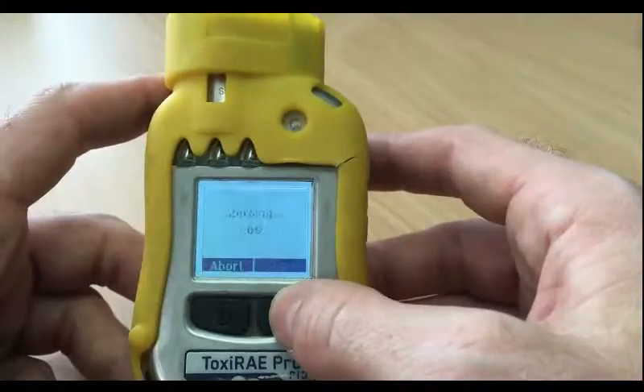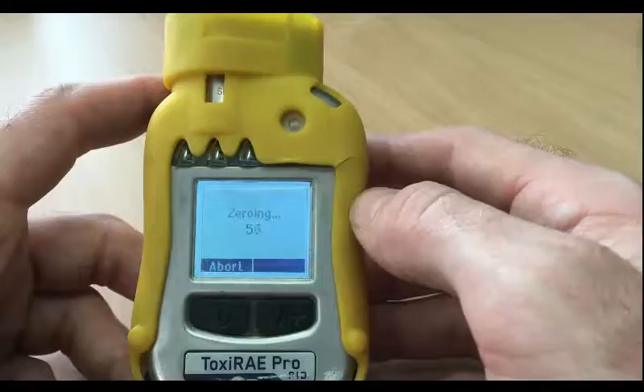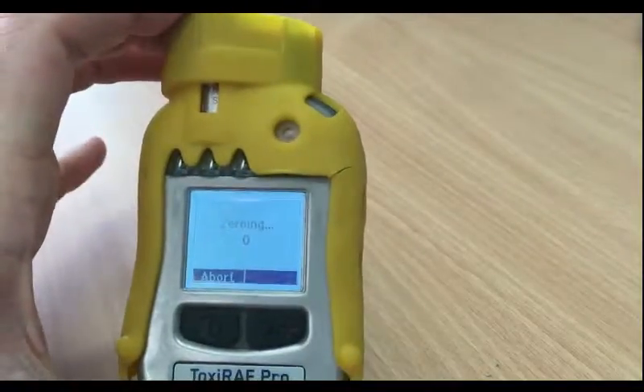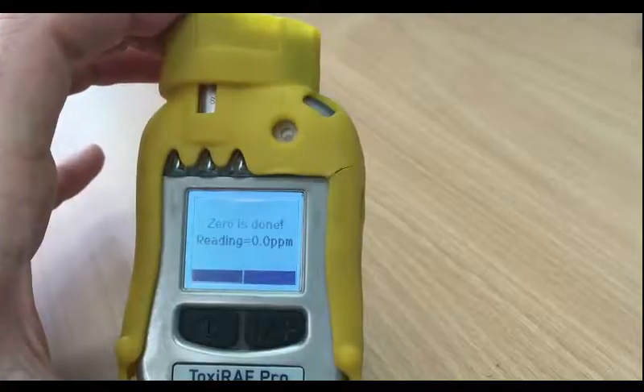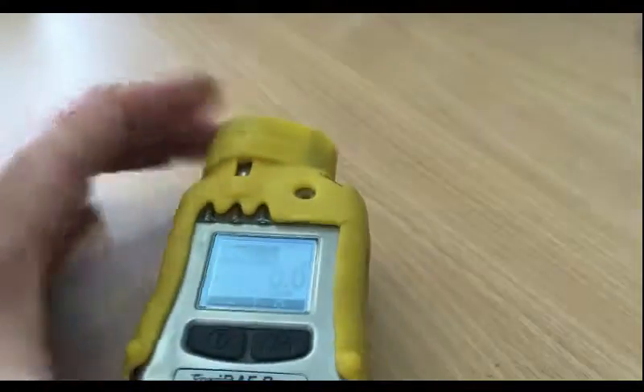Apply the zero gas. After the zero calibration, it's gone to zero and it's put the reading to zero PPM, so now the unit is running.